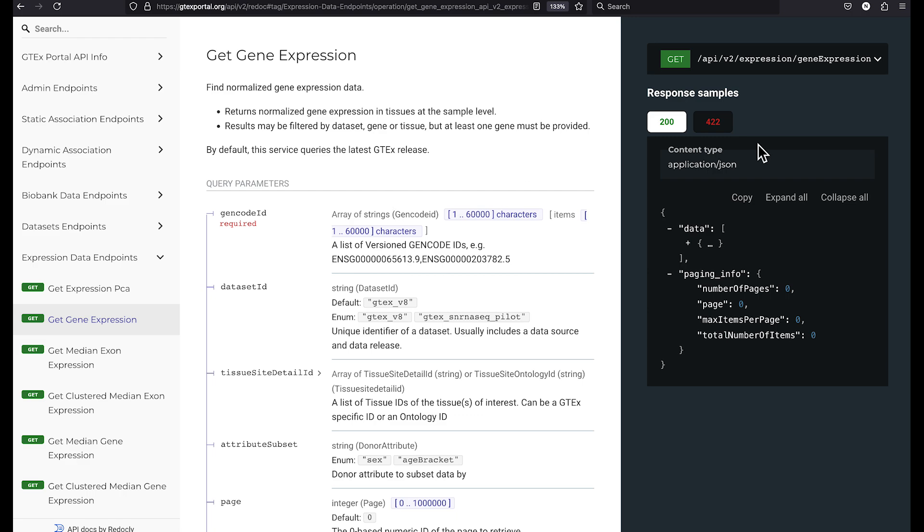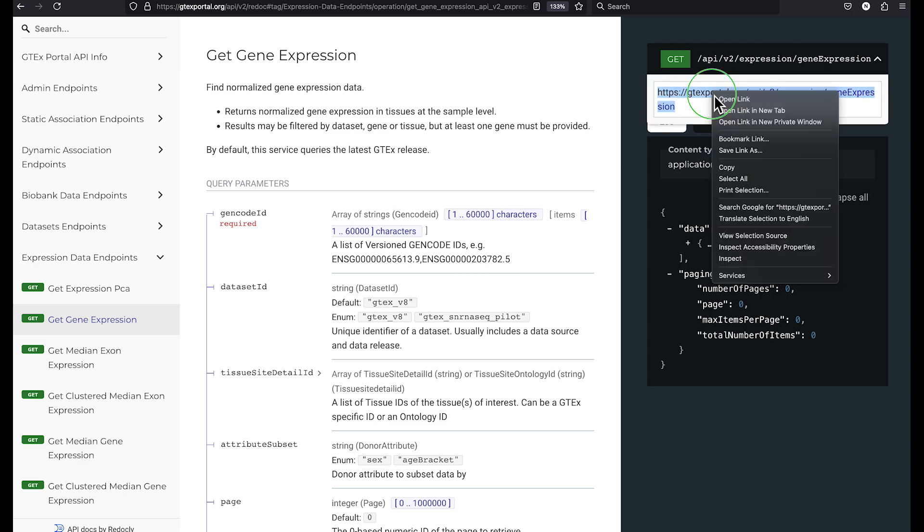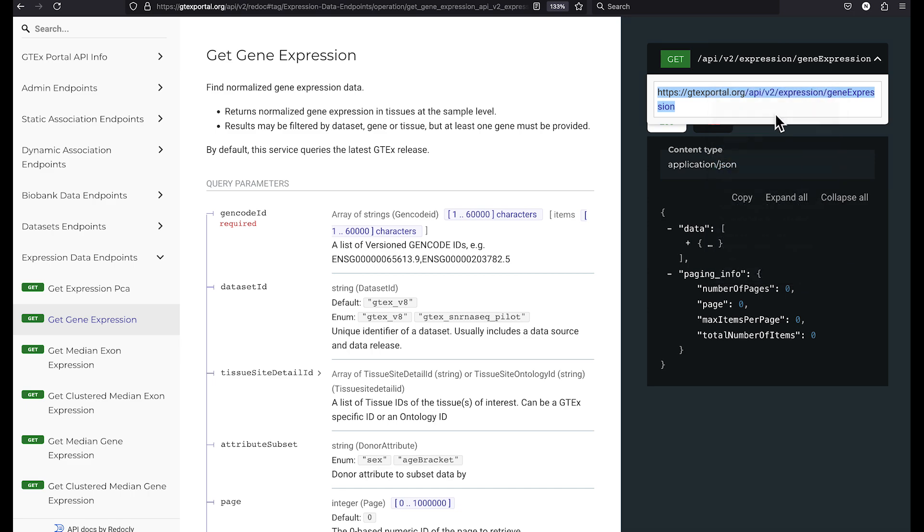If we look in the upper right corner of the page, we can see the base URL for the endpoint, so we will copy that. And in the center pane, we can see the documentation for the query parameters. For the gene expression web service, we can see that the gencode ID is a required parameter.